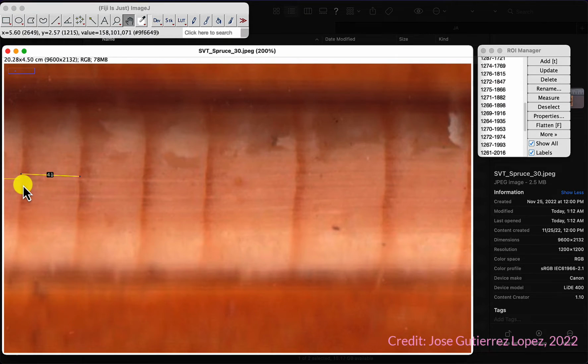You see, sometimes I use the zoom, sometimes I use the little hand tool. This one might have been a little to the side, so I'm just fixing it. Perfect.